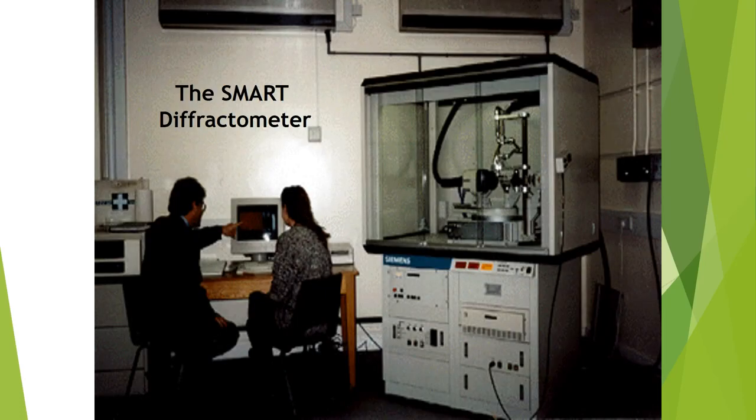Here is another pictorial diagram in which on one side we can see an XRD machine, the single crystal X-ray diffractometer, and this is connected with a computer which uses mathematical software to convert all the information coming from the X-rays in the form of a diffraction pattern. It calculates from these diffraction patterns values which can be used to find out the structure of that crystal.